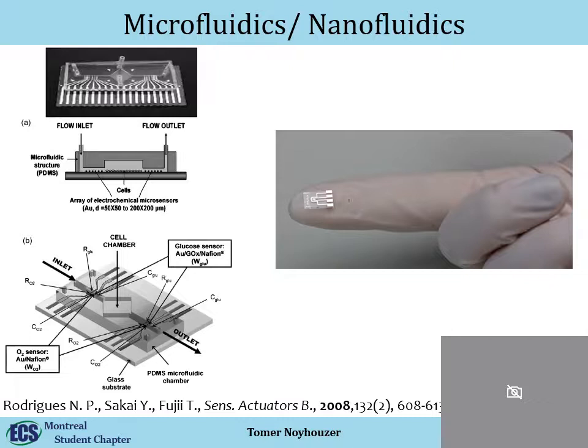So, first, this is a screen-printed electrode. Again, same idea, it's just smaller, so you can still use a jet flow, just make sure all the tubes are smaller. This is a flow-by, so you can see, just like Unwin did, it flows by the electrode, and then you have your outlet with the reference. And same thing, the only thing is the dimensions are much smaller, but all the things we talked about, all the things you need to think about, apply here.